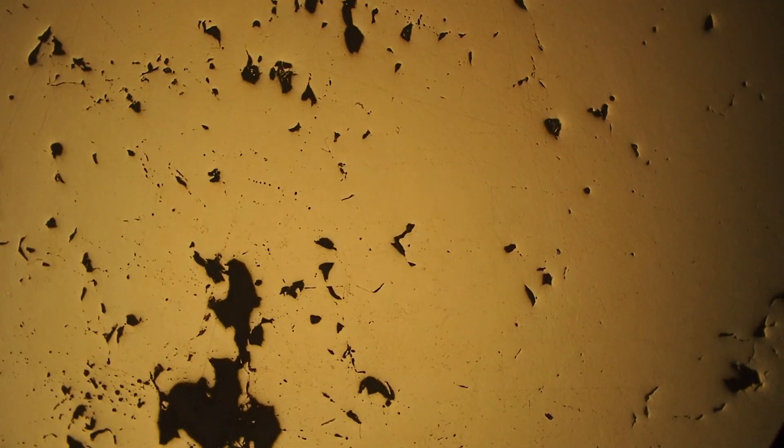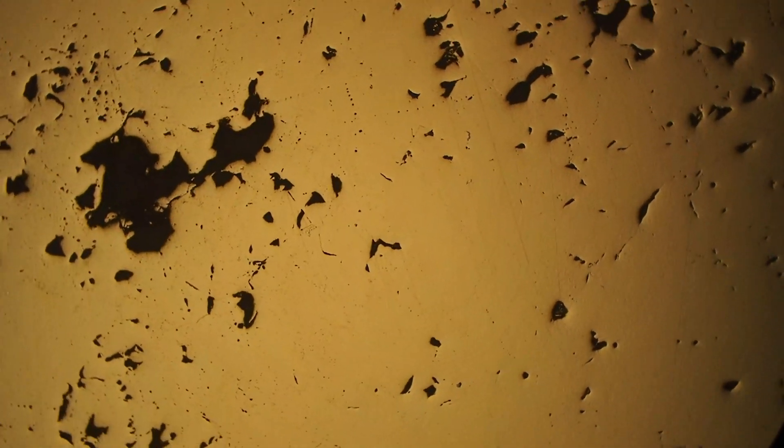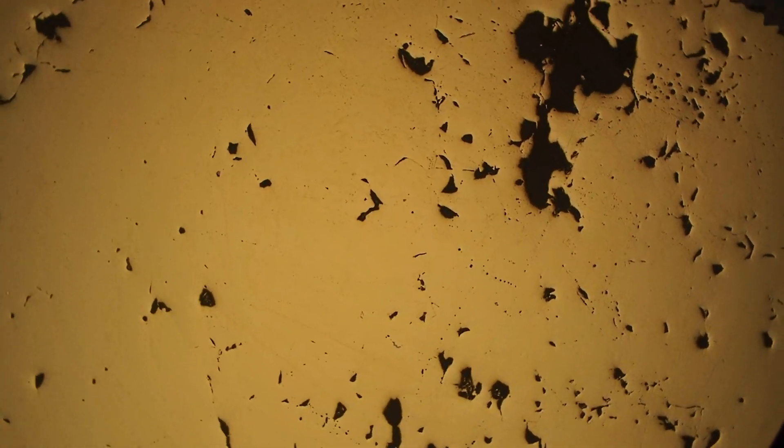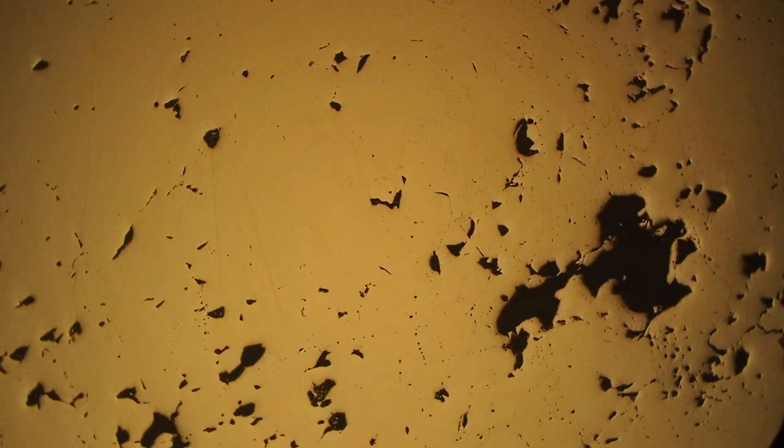We can see some of the scratches have been preserved, and these are small scratches showing the fine grids that are preserved, which is unlike pyrite or other harder minerals which sometimes preserve the larger scratches from polishing.